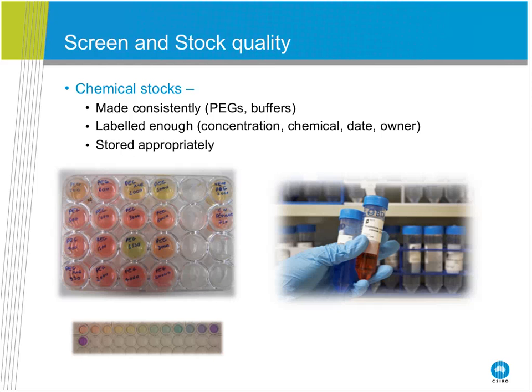And the color comes from putting a universal dye in, and that's shown down the bottom as a pH gradient going from pH 4 to pH 10. And so you can see pink means that the product is acid, and blue or purple means that the product is basic. You can see that all the PEG stocks that we had in C3, except for PEG 3350, were really quite acid. And the one that we were interested in was this PEG 2000, which was sitting down here, and we're going, wow, that is really quite acid.